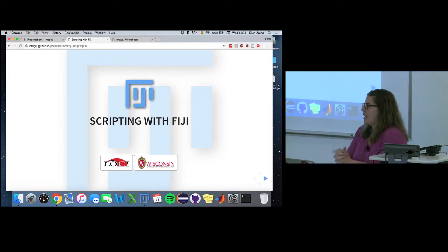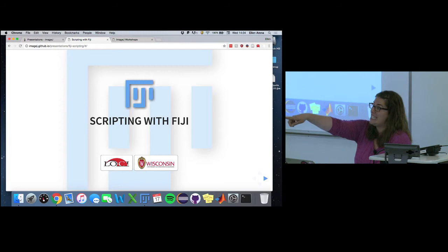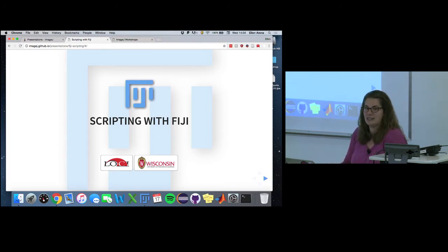So I'd say let's start. Okay, you guys are all ready to go. You've got the slides open, yes? You've got the data, the folder with 5 images. Okay, so let's start. I forgot to start yesterday by introducing myself. My name is Ellen Arena. I'm a postdoc with the Laboratory of Optical and Computational Instrumentation, called LOCI, here on campus. We are the maintainers of ImageJ. So you guys are lucky we're right here in Madison. Again, in back, we have helping today Yili and Allison. So if you have questions, just raise your hand. They'll help you. So let's get started.